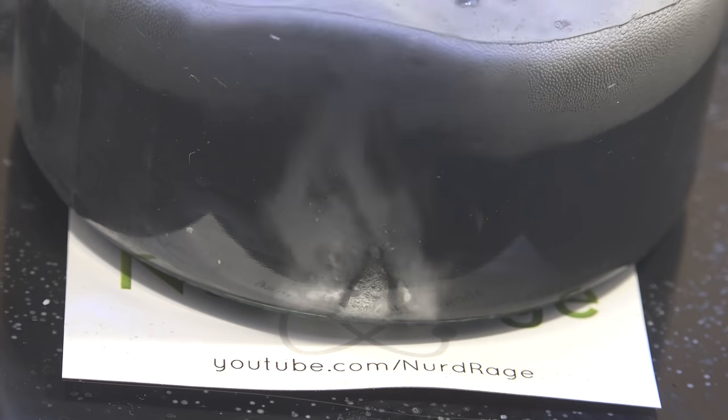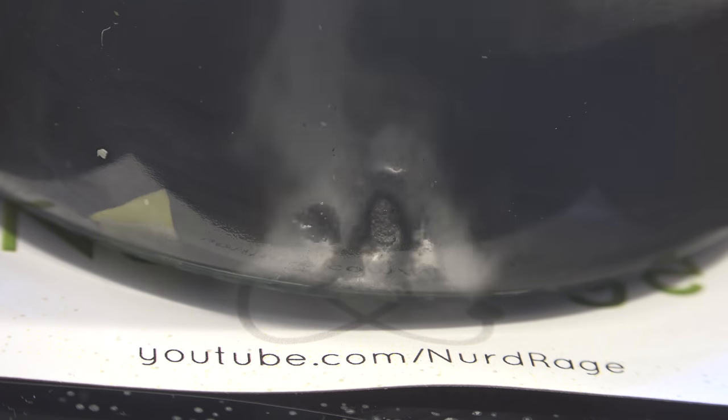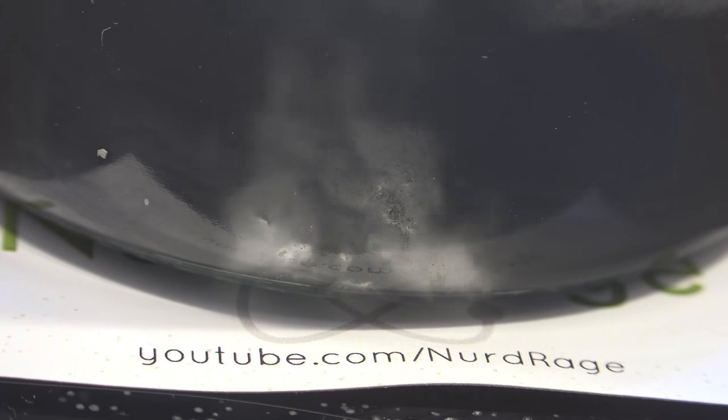As more and more of the aluminum is consumed, the alloy should liquefy as gallium becomes the dominant component. There's still a lot of aluminum in it, but the alloy will then pool into the bottom of the container. It's important not to let the reaction get too hot or the gallium will be consumed as well. Slow down the addition of sodium hydroxide if the self-boiling becomes excessive.